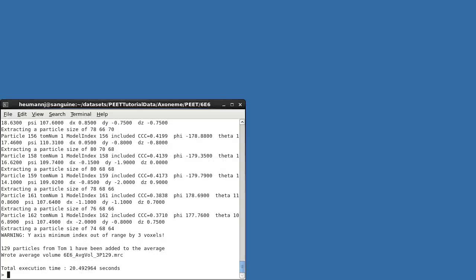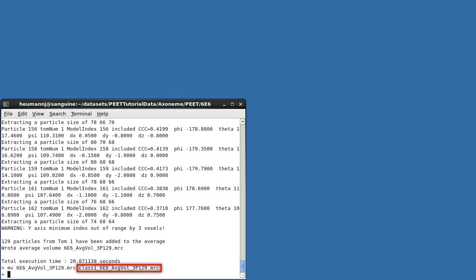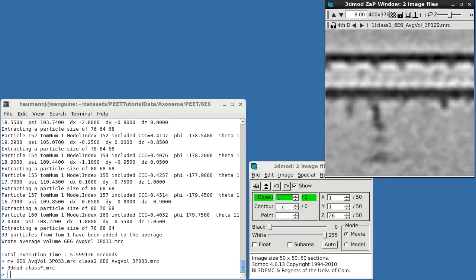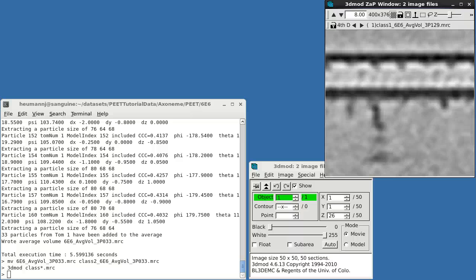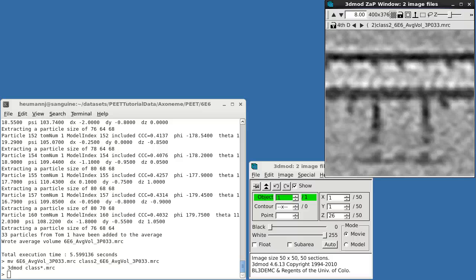When the average is complete, I'll rename it, adding a prefix of Class 1 to remind myself where it came from. I'll repeat these operations off-screen for Class 2, and then we can take a look at the resulting class averages in 3DMOD. You can see that Class 1, with 129 particles, is missing both radial spokes 2 and 3. Class 2 is much smaller, with just 33 particles, but contains both radial spokes 1 and 2, while radial spoke 3 is still missing. So axonemes within the mutant 6E6 strain are themselves heterogeneous, with radial spoke 2 missing in most, but not all cases.